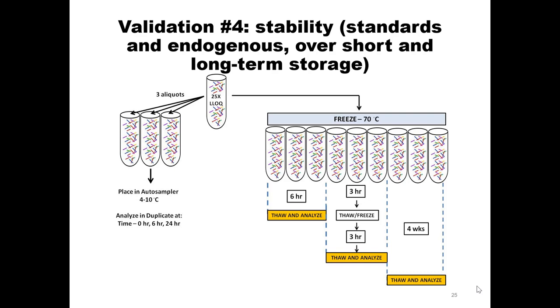Question? Sometimes the blood is collected and it's frozen, and then plasma is extracted. That's how our labs store plasma samples. So for this, if you have such plasma, does it make sense to conduct this kind of experiment? Like slowly, let it stand for 6 or 7 hours. So let me just double check that I understand the system.